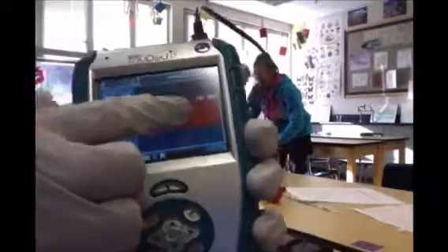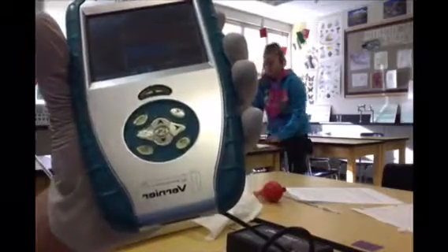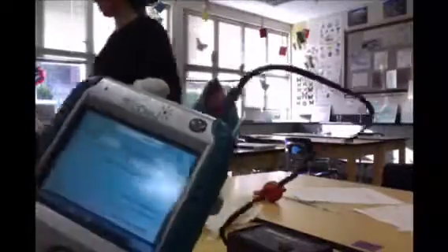From here, we're going to select the red screen again. And we're looking for mode. So we're going to go mode, actually. It was in the top right. And what we're going to look for is we're going to change the mode to time-based, right there. So it's on full spectrum. We want on time-based. And then we're going to go OK. In the bottom right corner, we're going to press OK from there.